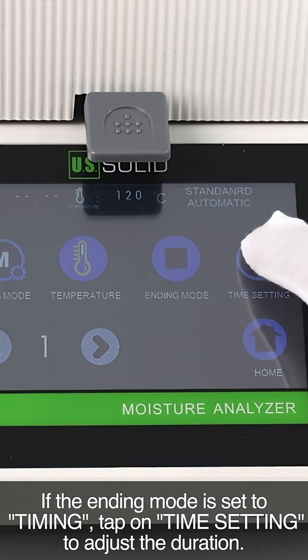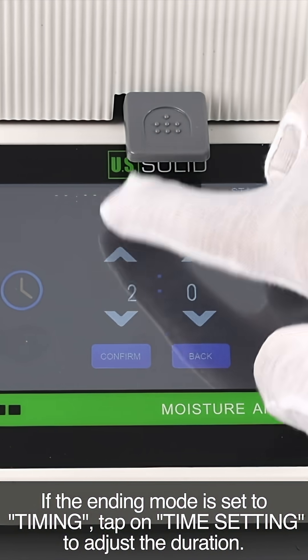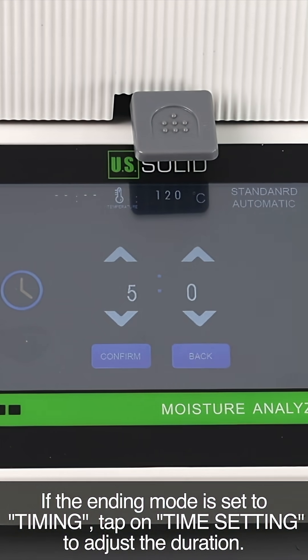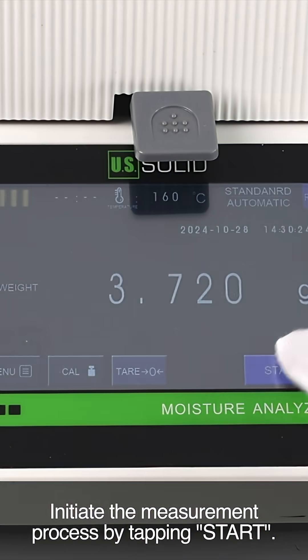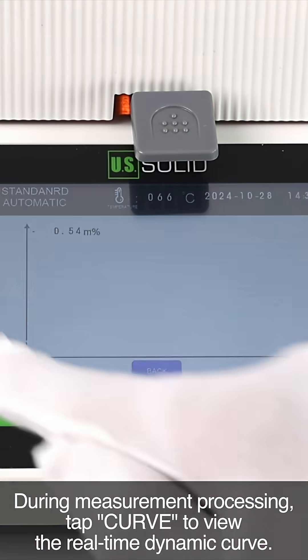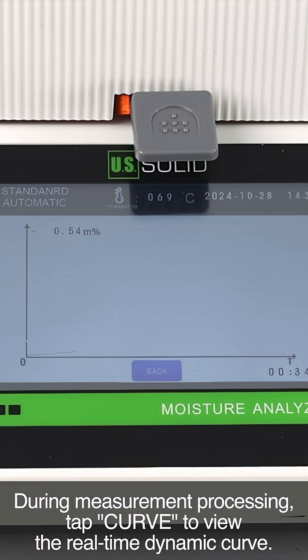If the ending mode is set to timing, tap on time setting to adjust the duration. Initiate the measurement process by tapping start. During measurement processing, tap curve to view the real-time dynamic curve.